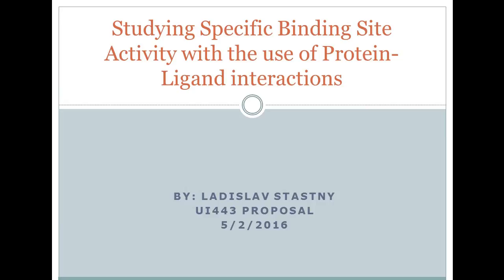Today, we will be looking at protein-ligand interaction and how this can be studied using chromatography and UV-Vis spectroscopy.